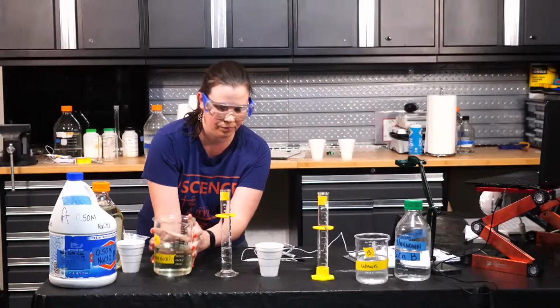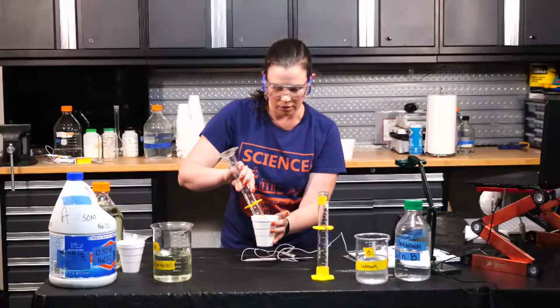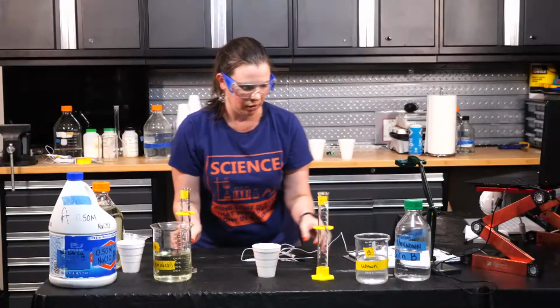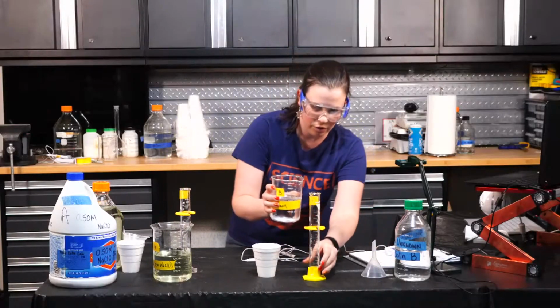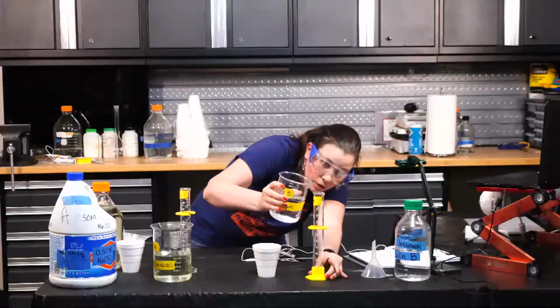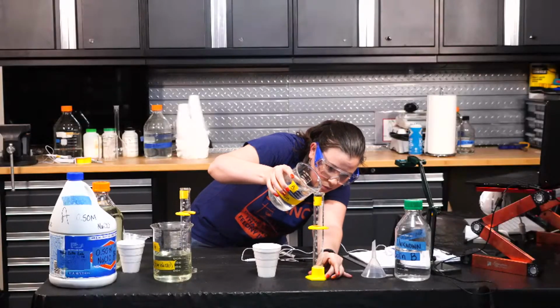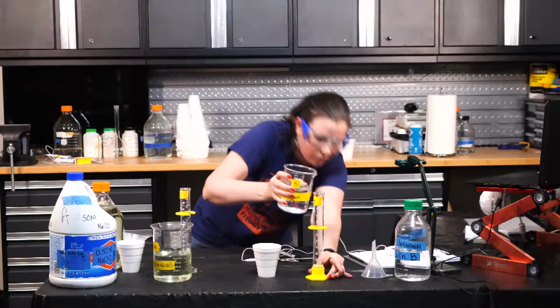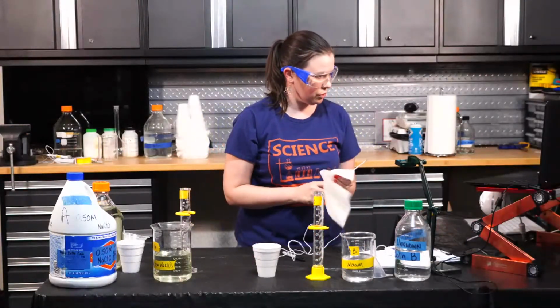There we go. Go ahead and put that in the graduated cylinder. And then we have 15 milliliters of solution B. There we go. All right, so let's get our initial temperature.